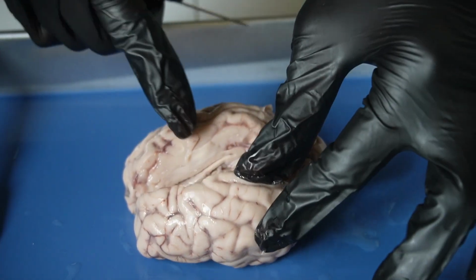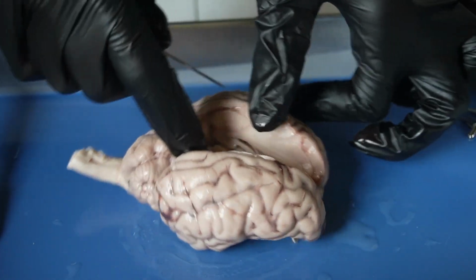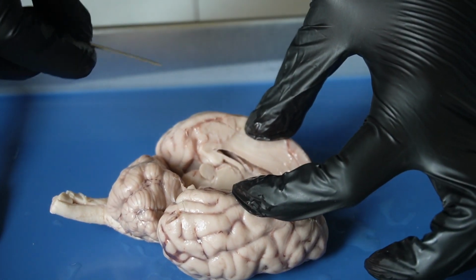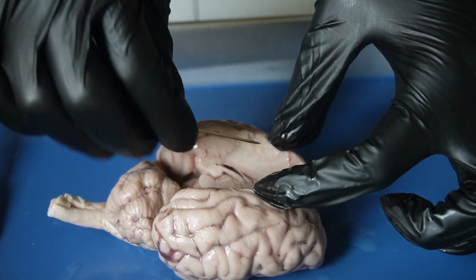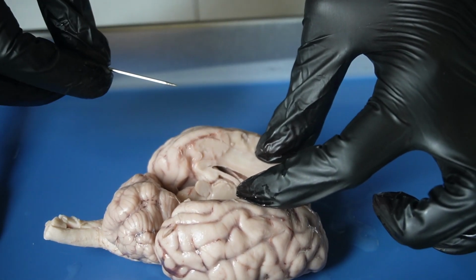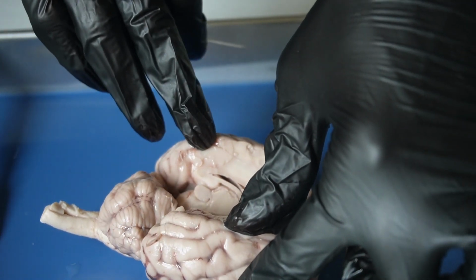The next brain structure would be just the one that I picked. Oh goodness, I hope I didn't cut it off. I don't think I did.